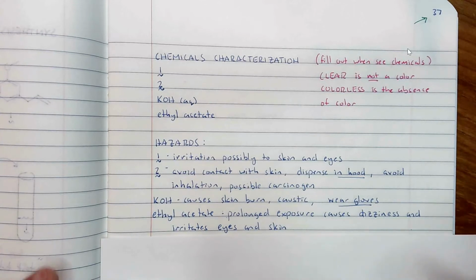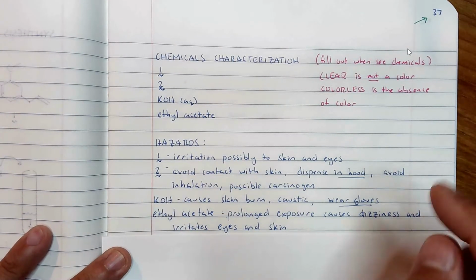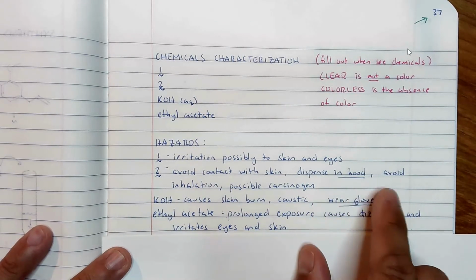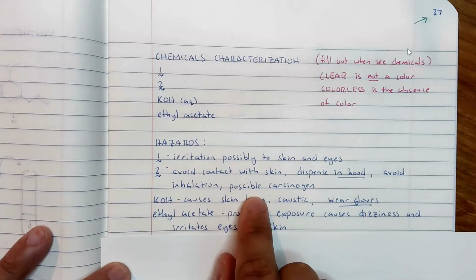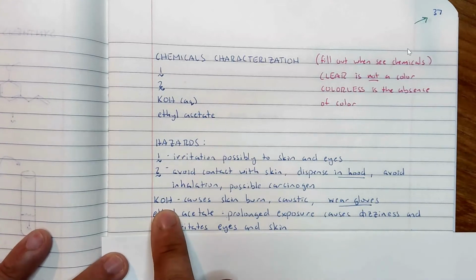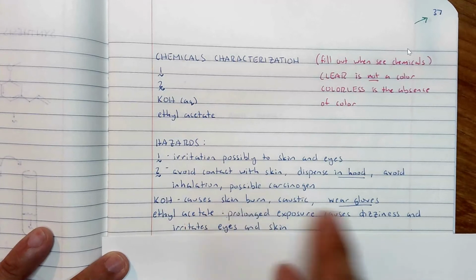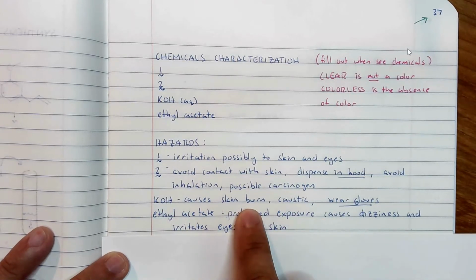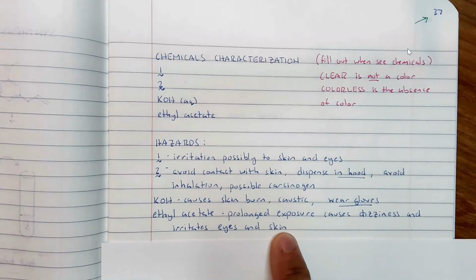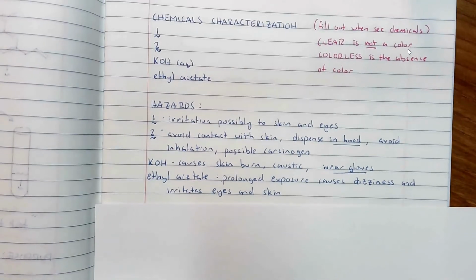With extended exposure. Number 2 is a little more serious because in the procedure I said it dispenses in the hood, the fume hood. So you want to avoid inhalation because it is a possible carcinogen if you have prolonged exposure. KOH is a very strong base, and you know that from general chemistry. Wear gloves, it could cause burns. And then ethyl acetate, if you have long exposure, it could cause dizziness if you inhale the fumes for a long time.